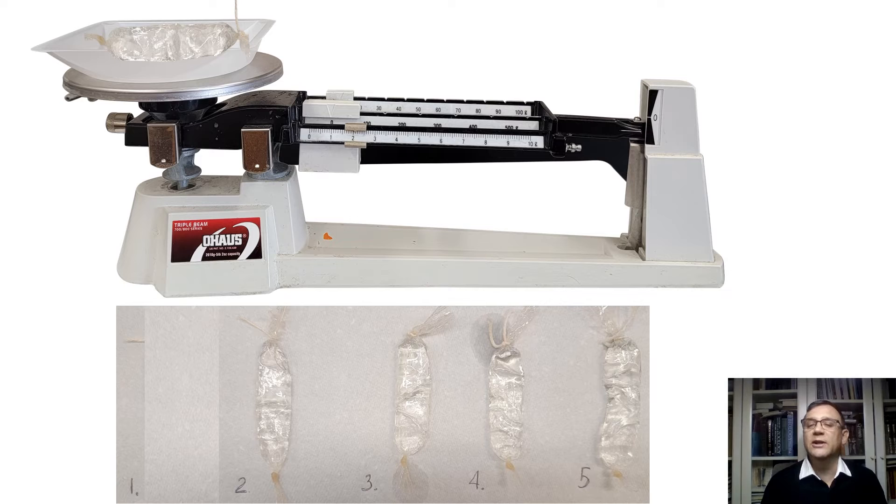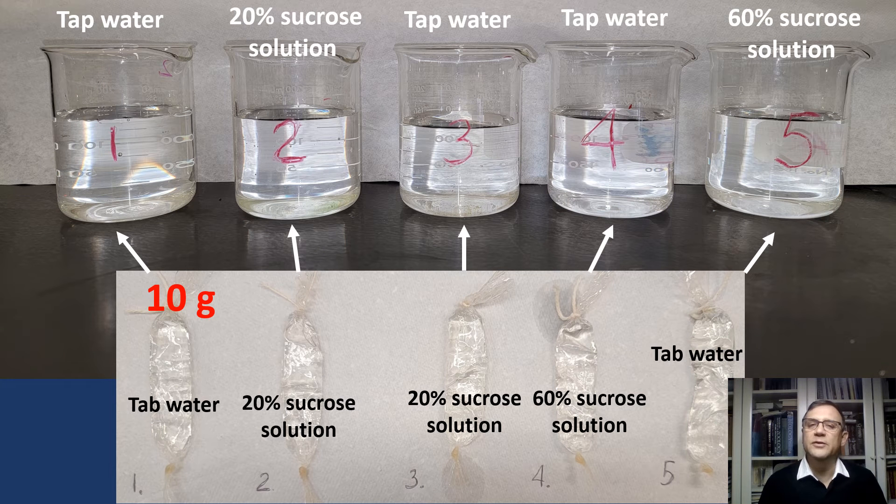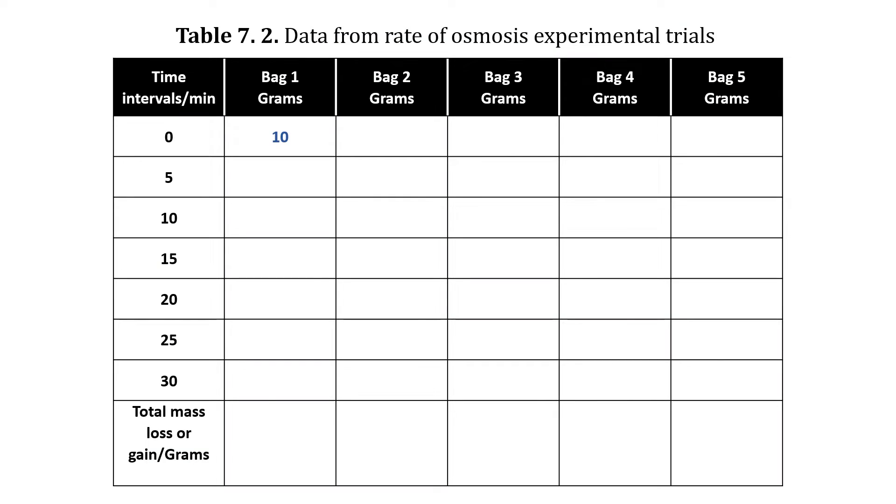Before we submerge our dialysis bags into the beakers, we have to weigh them one by one using laboratory balances. The mass of our first bag is 10 grams. Record this measurement in the data table. This measurement is quite accurate, as one milliliter of water has a mass of approximately one gram.